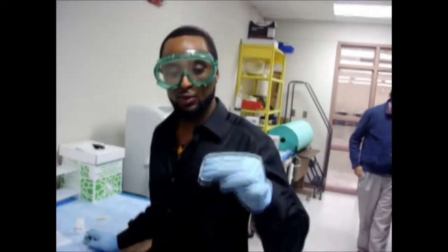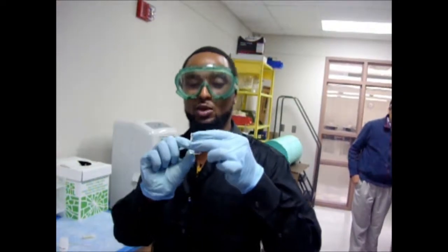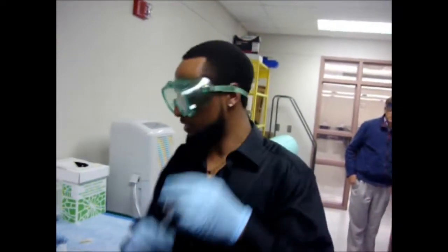Our very next test will be to run the NMR on our product Lidocaine. So what you have to do is just put a minute amount of your product Lidocaine into this beaker right here.